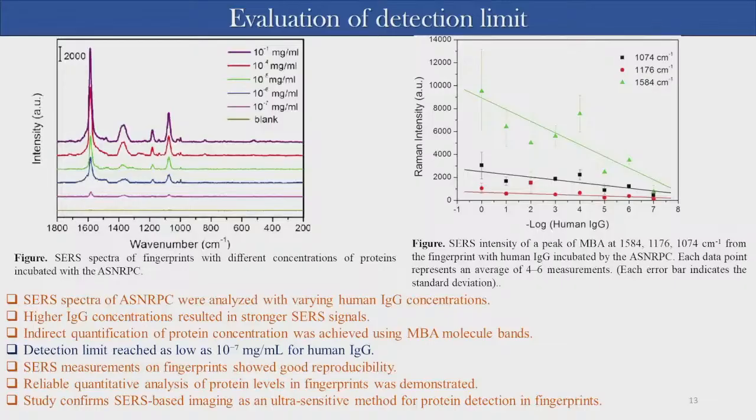And usually we plot a graph, and then you will say what the detection limit is. In this case, they have used 3 wavelengths to detect. And this bar you might be knowing, what is this bar called?